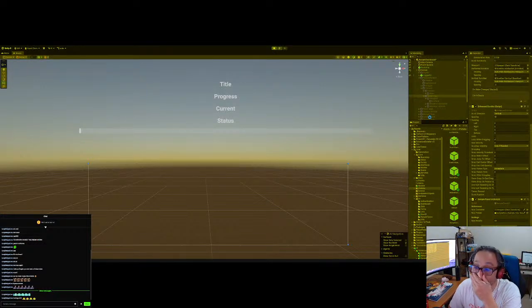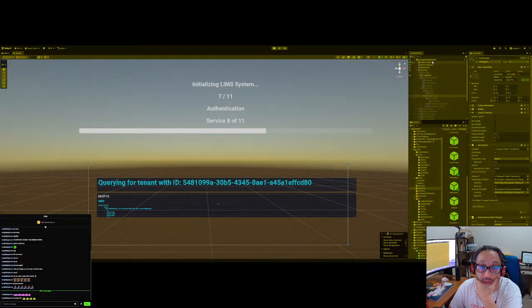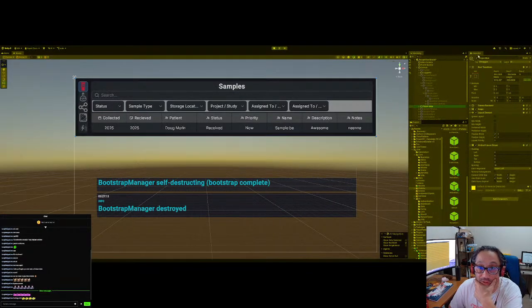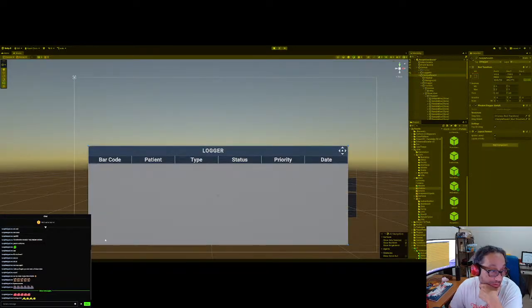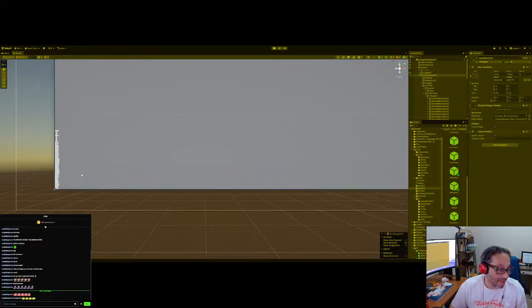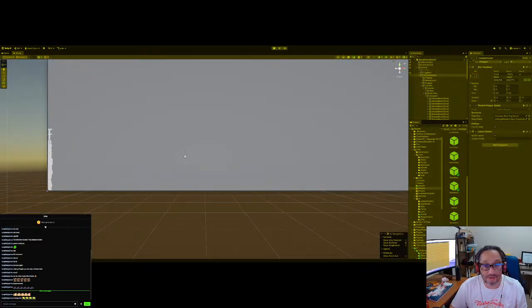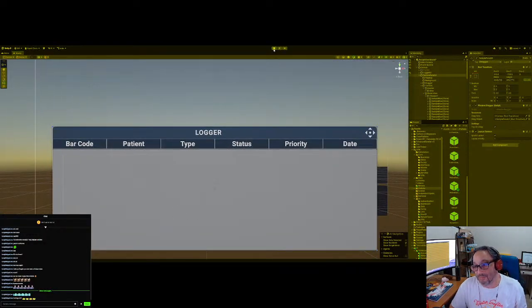All right, so we're going to load it. Just turn these off for right now, and then we're going to go to the sample panel, and here it goes. As you see here, all the rows are crunched in, and this is what we're going to fix tomorrow. So come back tomorrow to see how we fixed it. I broke it on purpose so I could show you these are the mistakes that people often make. So we're going to fix it tomorrow.